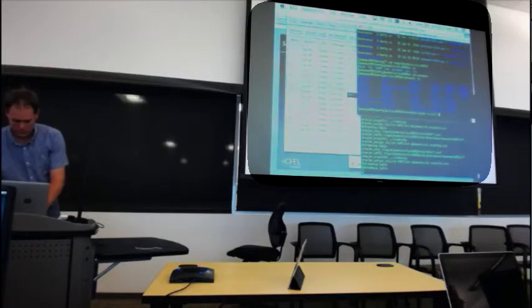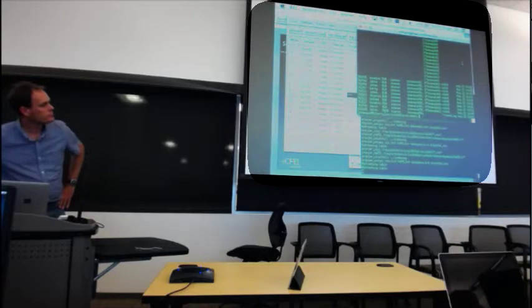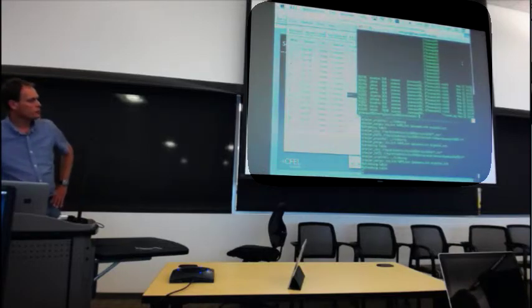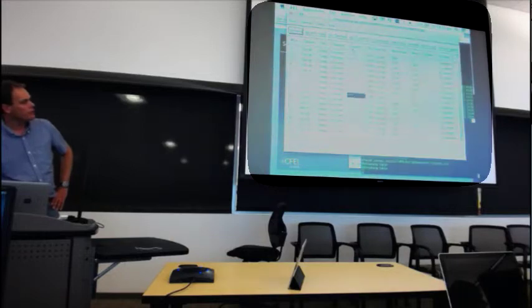We're just going to change the process file. Okay, so things should be running there. Unfortunately for this one, the hit rate is a bit low for the first little bit, so you mightn't see things popping up quite immediately.